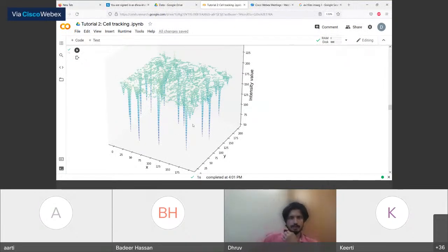Now, your algorithms such as thresholding work by slicing this 3D contour into sections of foreground and background. So what usually happens is you specify a threshold of 100, and everything above 100 or below 100 is removed depending upon what region you want.